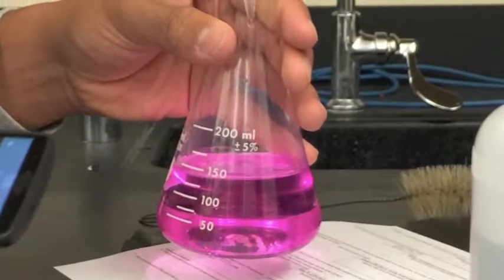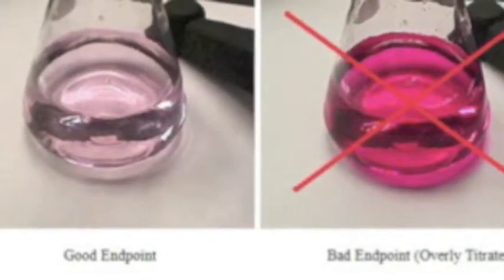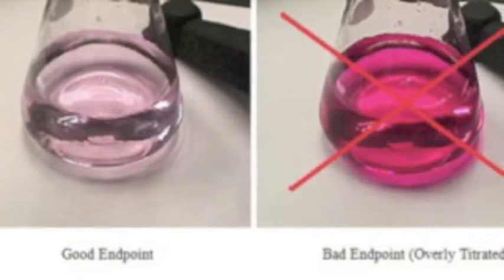The average concentration that was promised was 12% of acetic acid, and our lab resulted in 11.7%. This means the acetic acid will result in a different taste. These findings suggest that the concentration was not the average 12% that was promised.